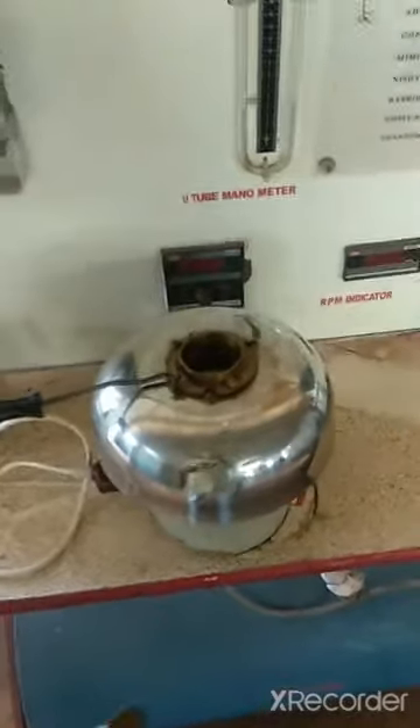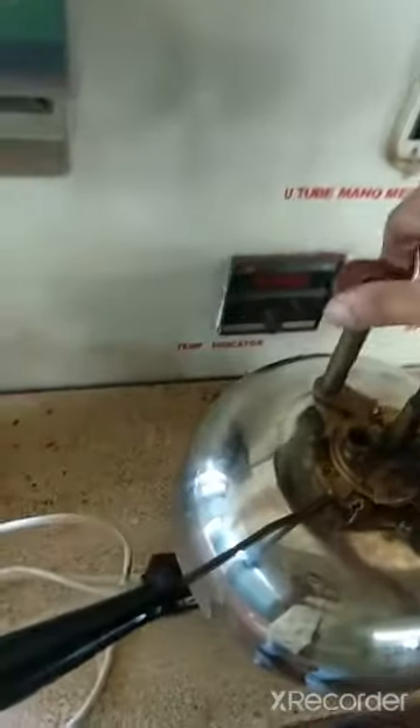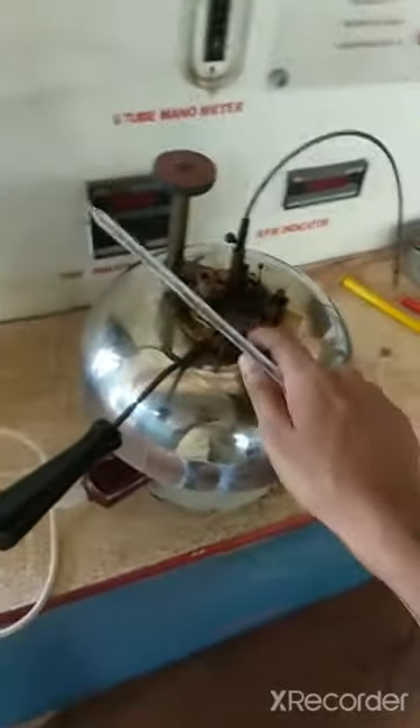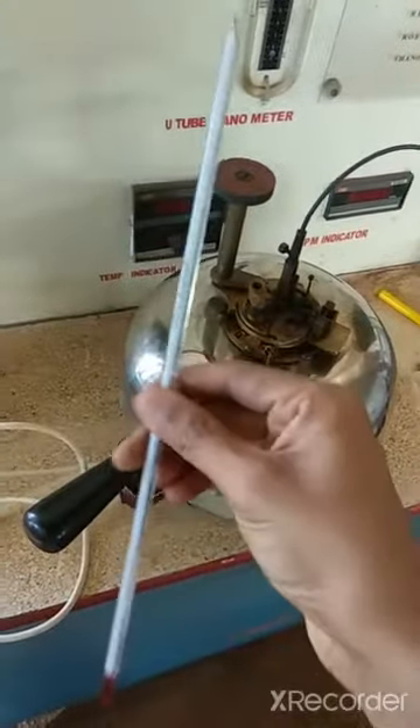Now let's fix the device and set it up. Let's fix it in the seat and see how the operation works. When we are doing this with the device, we are using a thermometer.